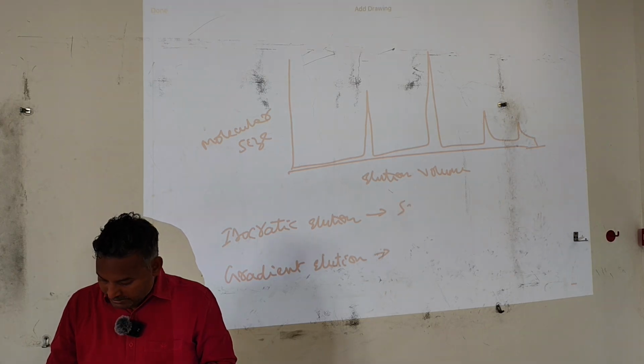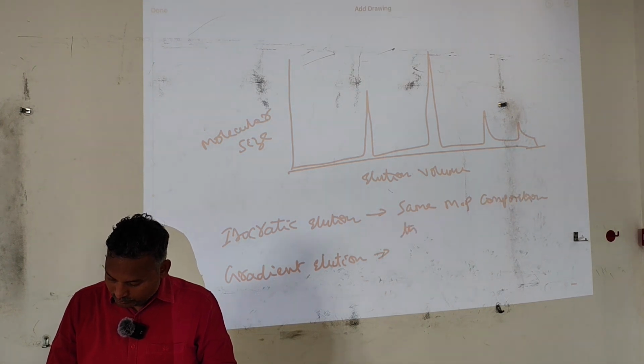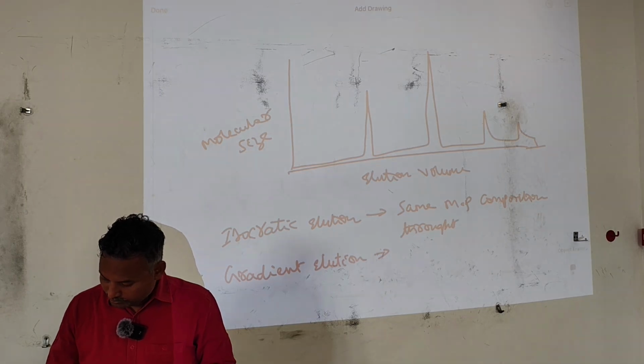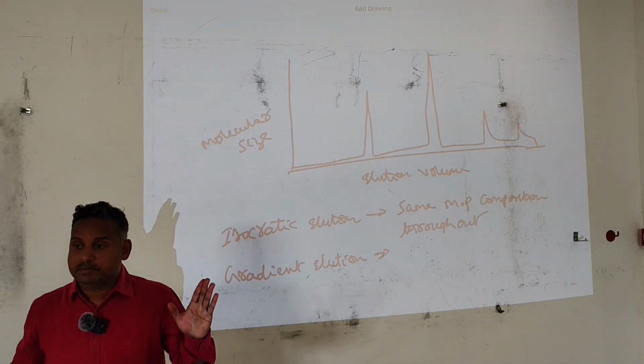Okay? That means the same mobile phase composition throughout. Same mobile phase composition throughout the experiment.